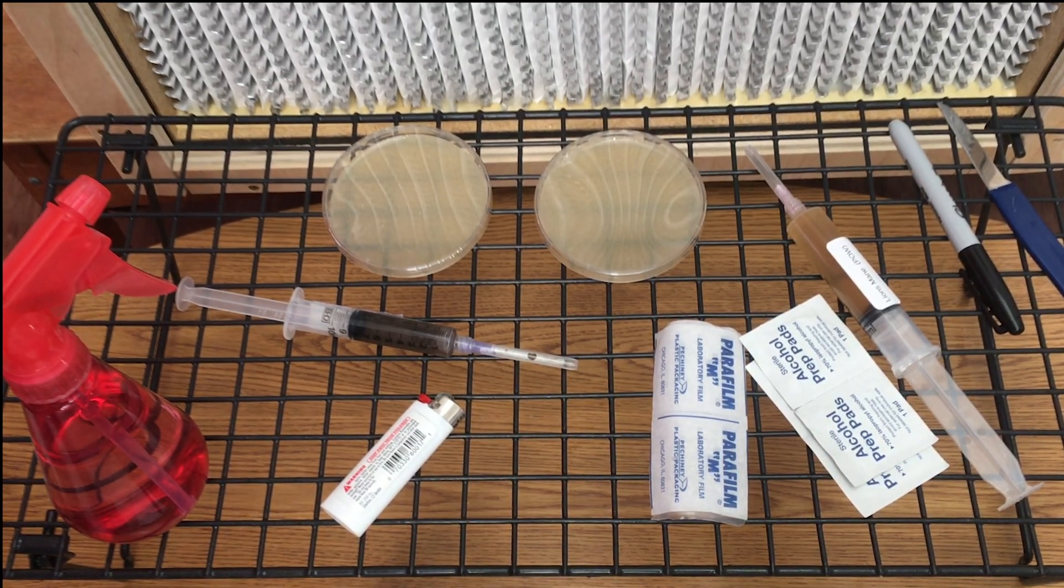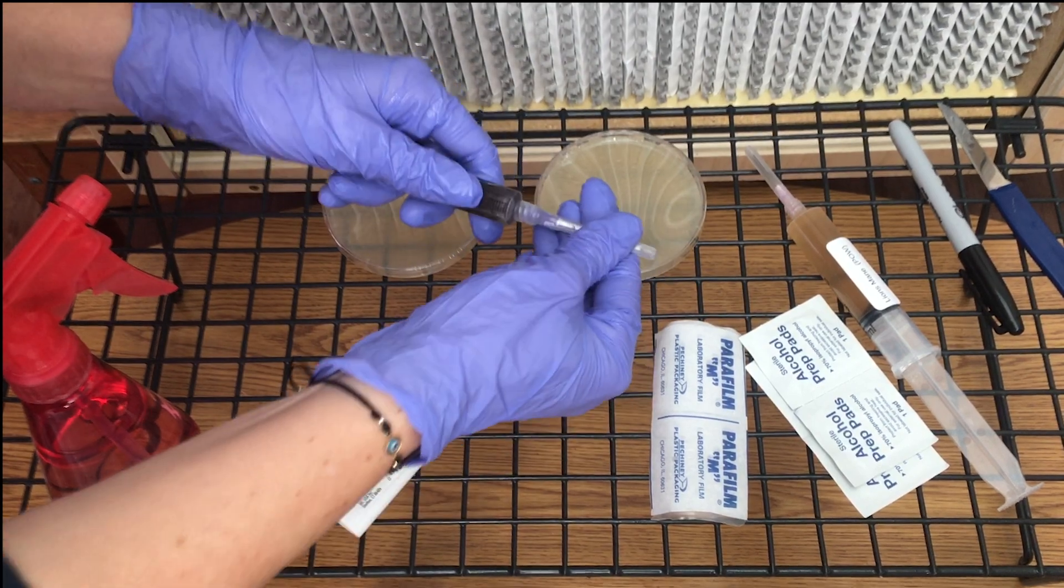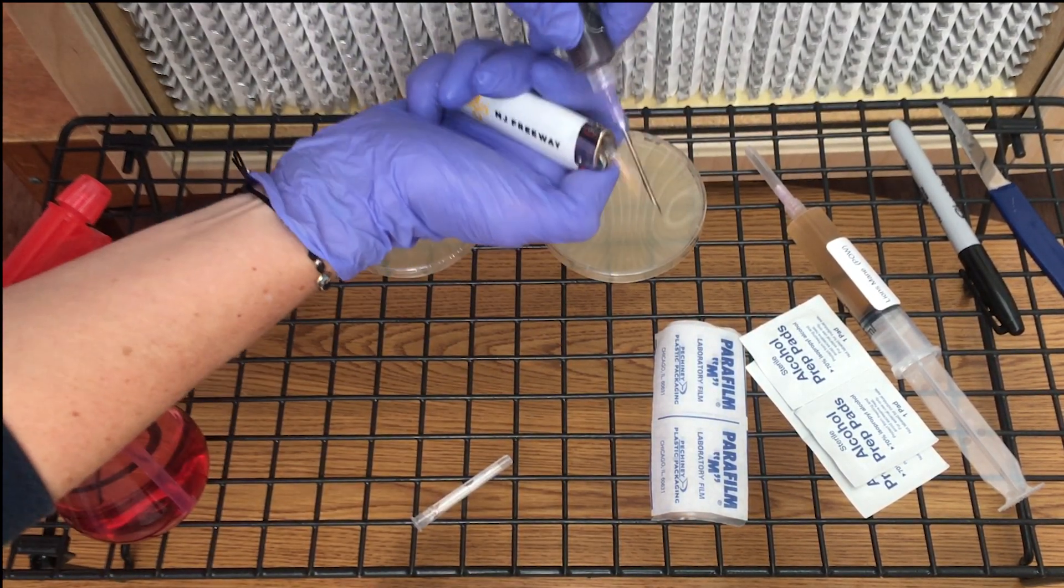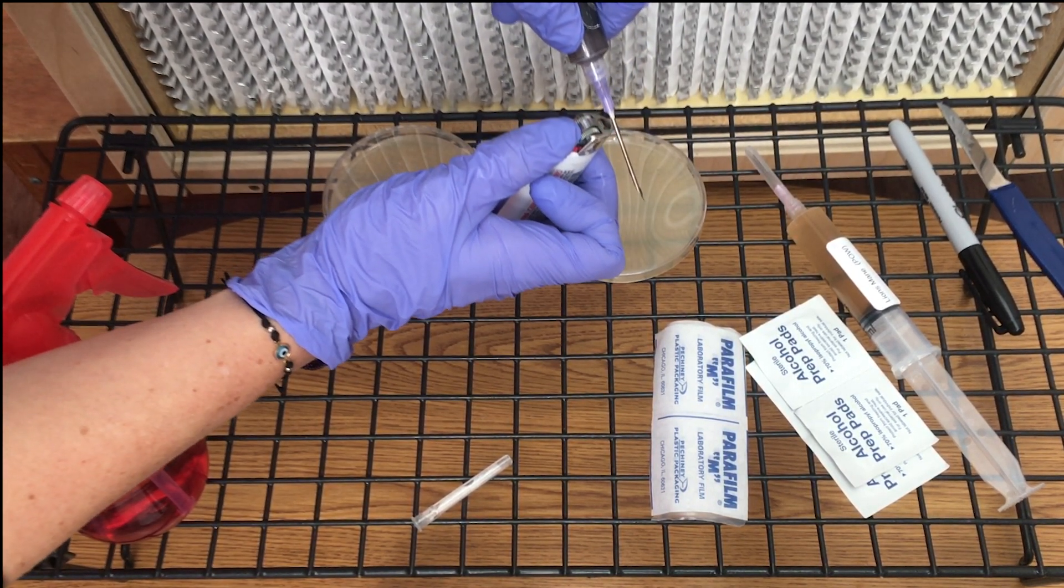Now we are ready to inoculate our agar. First, shake up your spore syringe until the spores start to break apart. Then flame the needle for 30 seconds until the needle starts to become black from the soot.